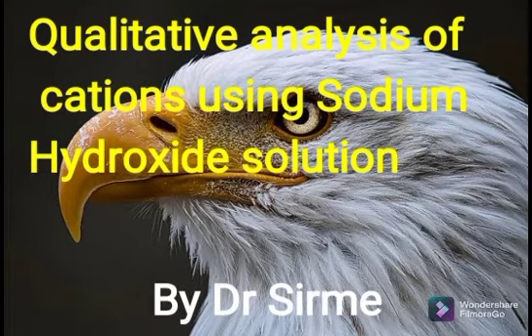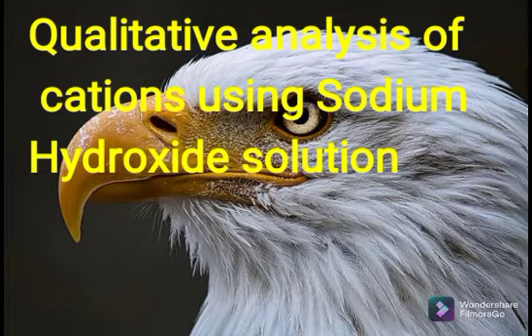Qualitative analysis of cations using sodium hydroxide.